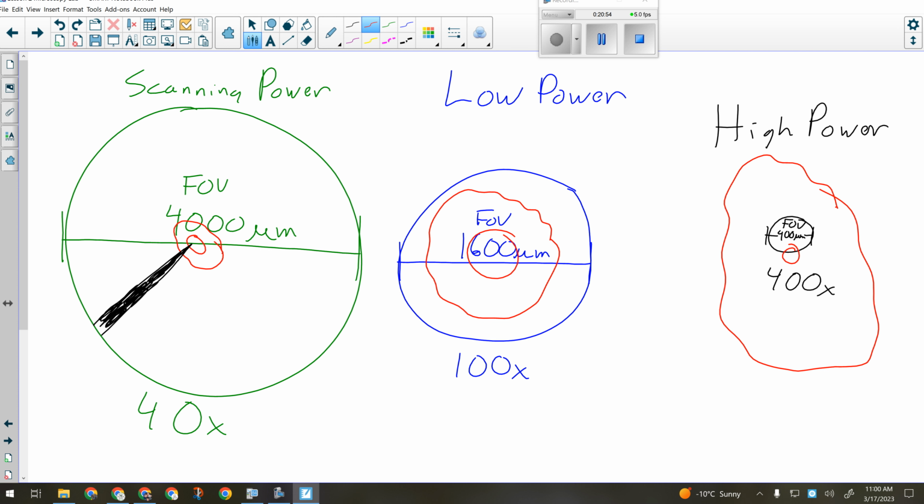Okay. All right, so that's what we'll have to do throughout the lab for each one of our specimens. Letter E, we're only looking at here. Amoeba, we're only looking at on low power because it'll kind of be like that. It'll take up pretty much the whole space. Okay, and then on high power, that's why we're not looking at the amoeba on high power. You won't see it all, but you will see all of the paramecium and all of the euglena on high power, which is why you should view them there.